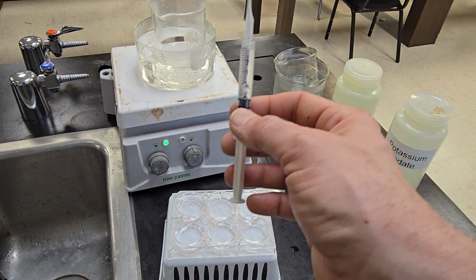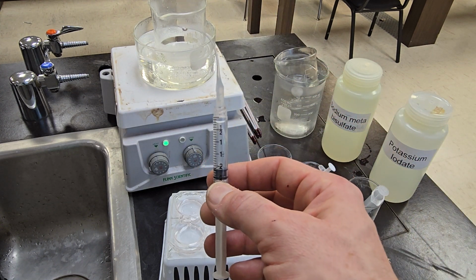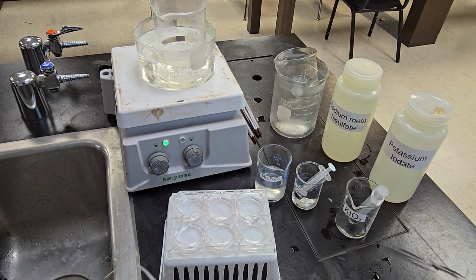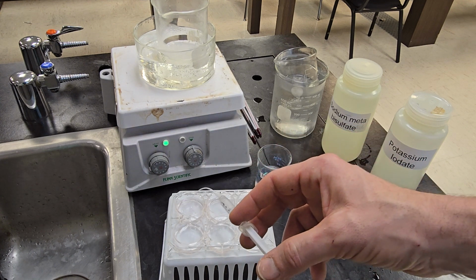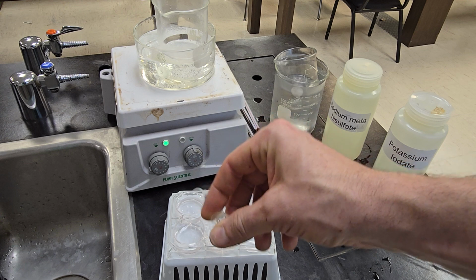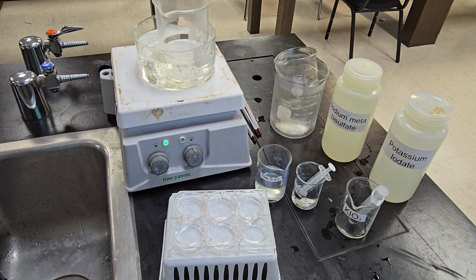Okay, I've got my 2 milliliters of sodium metabisulfate. I'm going to add them. Keep an eye on the time mark at the bottom of the video the second I add this, the second I add it, and then you count to see how quickly the reaction takes. Here we go, adding. If you did not mark the time, go back.